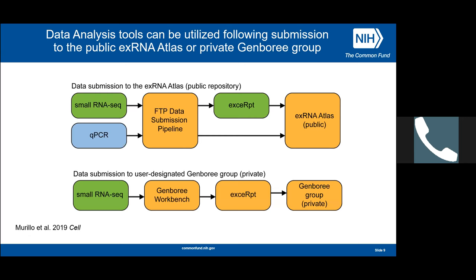This just shows a couple of the workflows that make use of exceRpt. On the top, again, the Atlas is a public resource, so whether it's starting with small RNA-seq or qPCR, you go through the FTP data submission. You see that the data goes through exceRpt, and after an embargo period becomes available in the Atlas, anyone can access it. Down below there's another option.